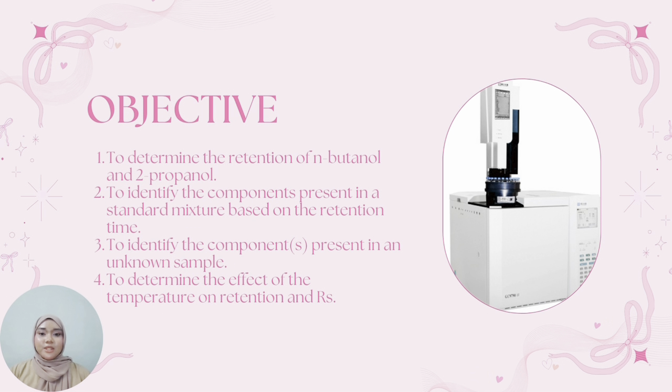Next, for the objectives: first, to determine the retention time of N-butanol and 2-propanol. Second, to identify the components present in a standard mixture based on the retention time. The third one is to identify the components present in an unknown sample. Lastly, to determine the effect of the temperature on retention and resolution.